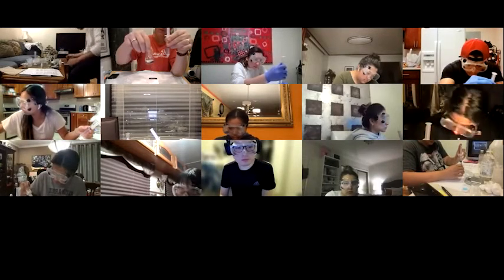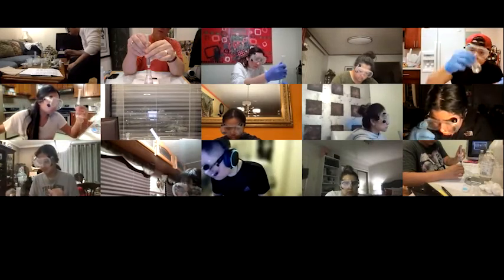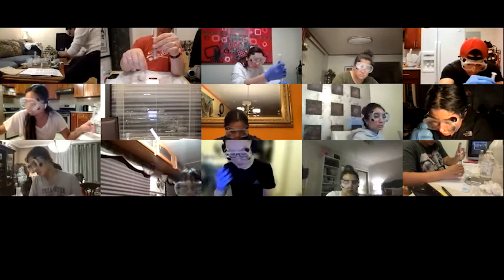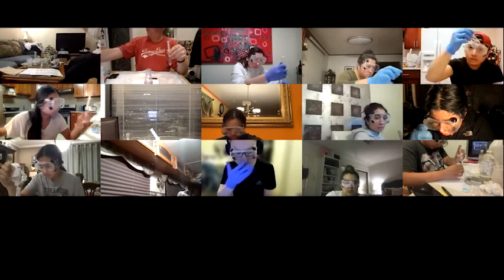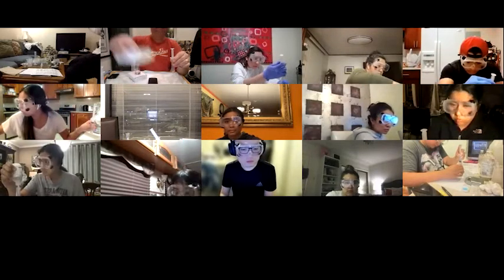Get super close. It should get a little paler color. There we go. It's a little more white.